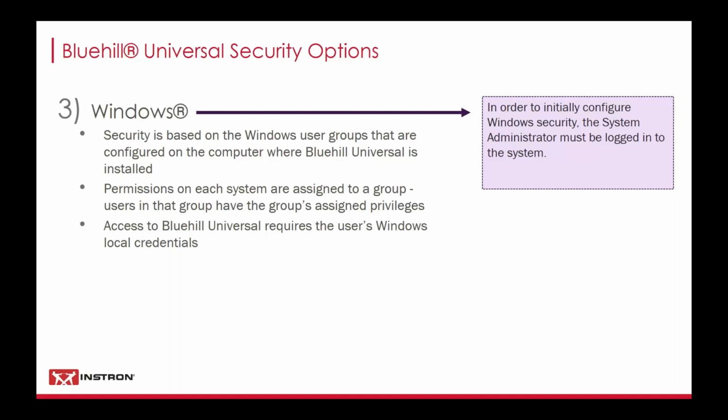So just something to keep in mind, the system administrator of the computer where Bluehill is installed will need to be the first person to configure security as the administrator. Now, obviously, once that administrator logs in and adds more Windows users, they can also make those folks the administrator as well, but just something I wanted to clarify.